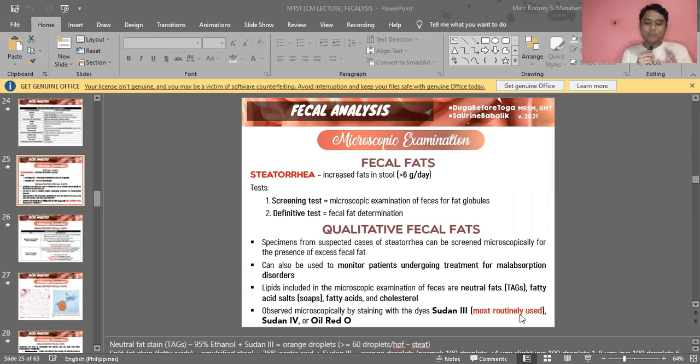All right, so for this part we're going to start with the main bulk of the analysis of feces. Again, take note, dears, for CM or ClinMic, our purpose of analyzing feces is not to detect parasites. Okay. Well, although it's part of, as one section in CM and the routine laboratory. For the CM itself, we're after different substances or different other cells in the stool that can indicate disease. And to detect parasites, that's in the parasitology section.